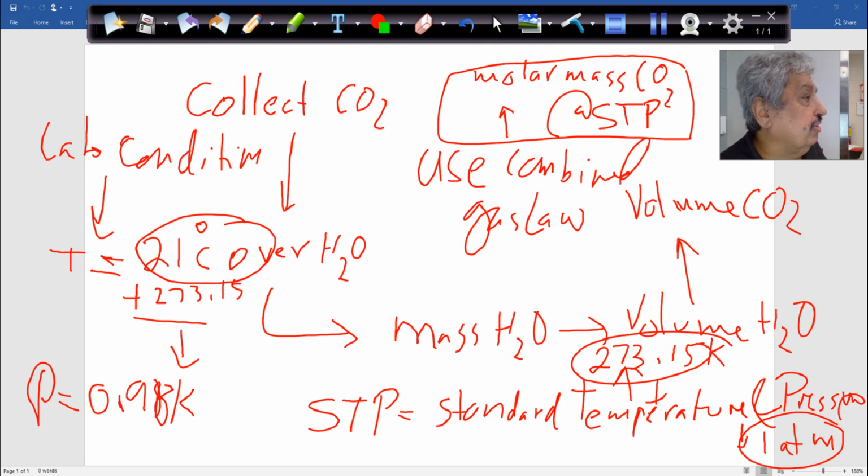I don't see any manometer, but I'll look into it. If there is no manometer here, then we'll be using whatever the procedure says, the values 0.98, 0.99. We are very close to the Savannah area, so it's four hours, not far away, so we are close to sea level. So it should be close to 1 ATM, correct?